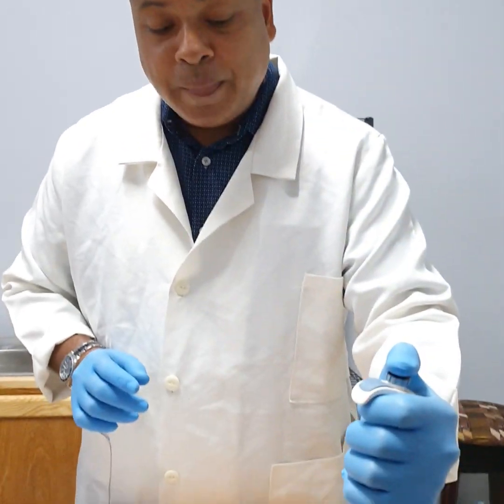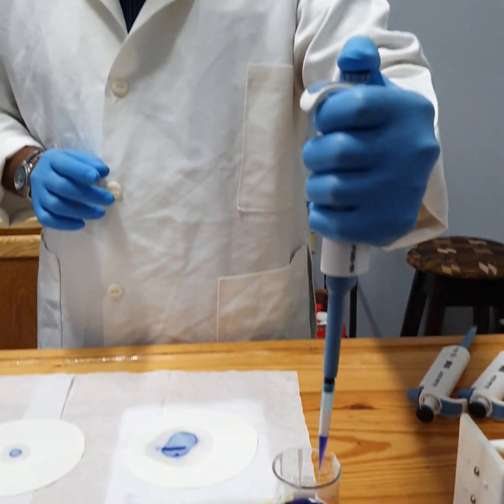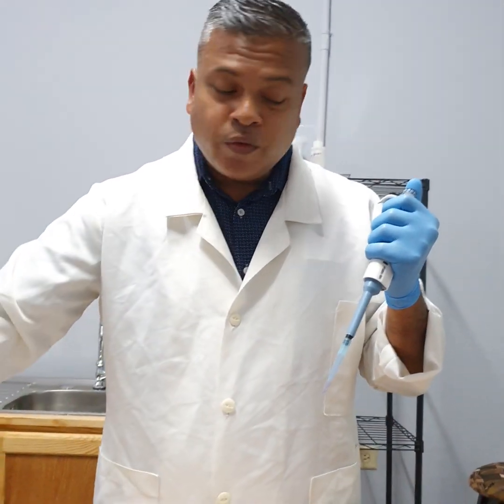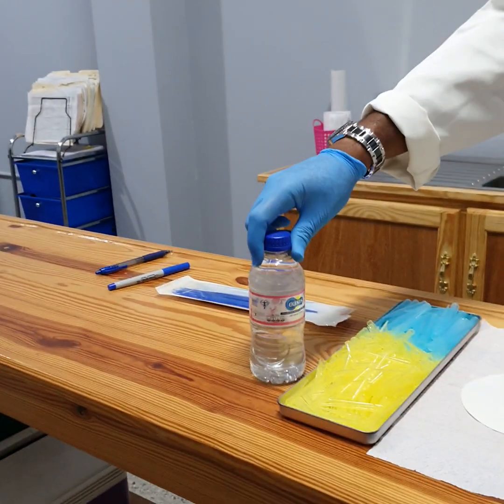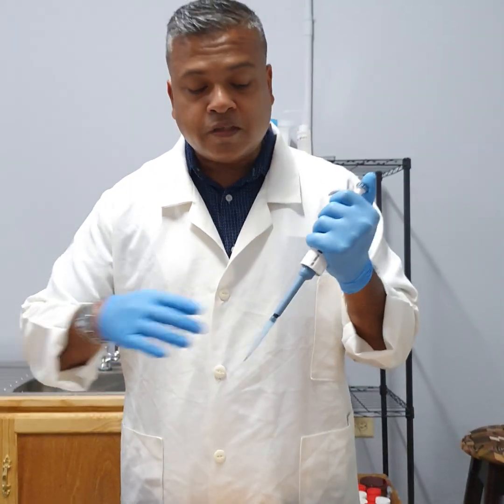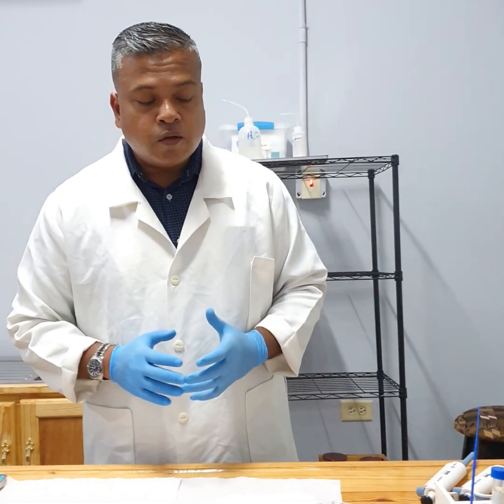to 1 milliliter, which is this 1 milliliter, and 1,000 milliliters is equivalent to 1 liter, which is kind of like 3 of these bottles. I'm just using this comparatively so that you would appreciate precise measurements and volumes in the laboratory.